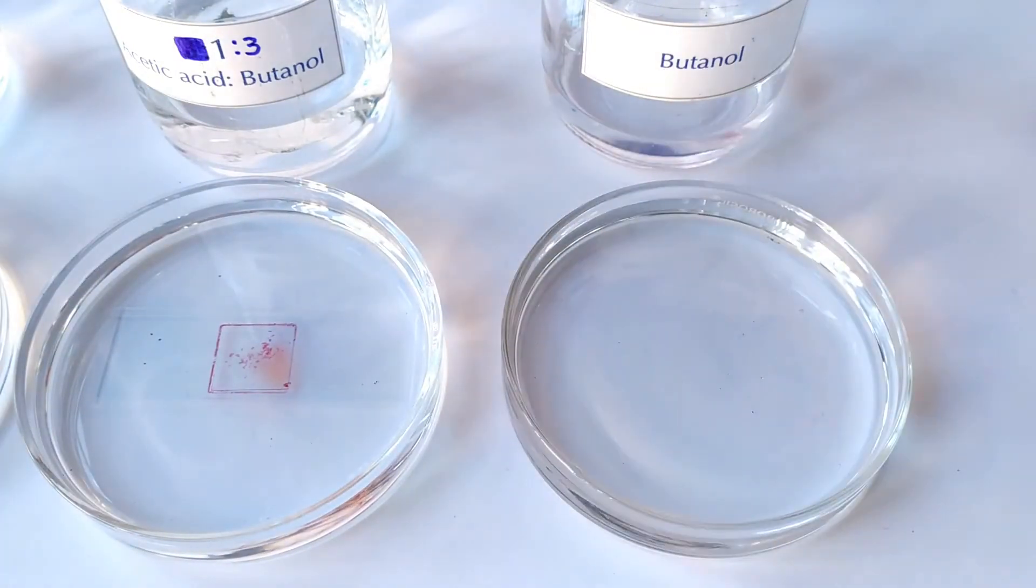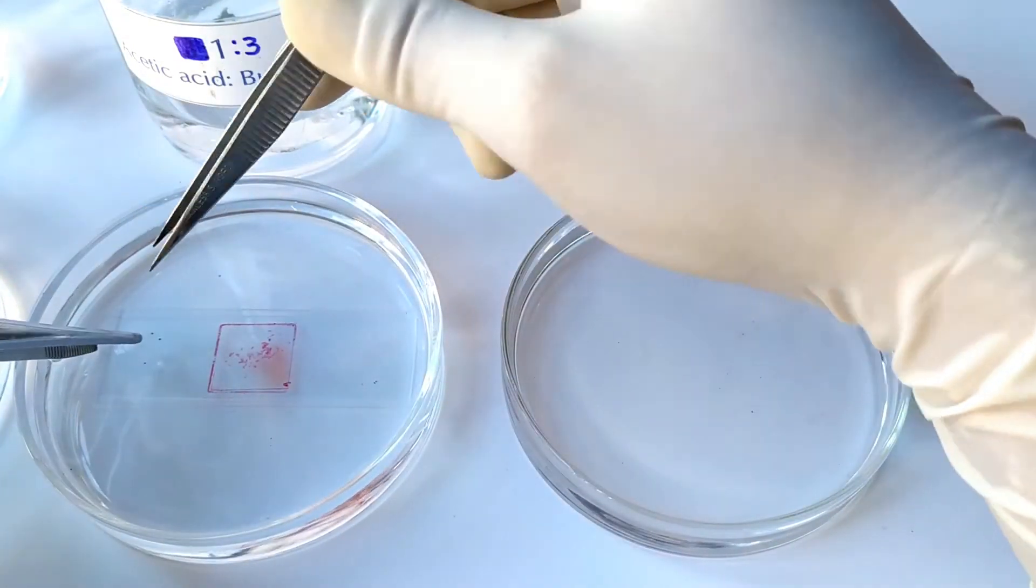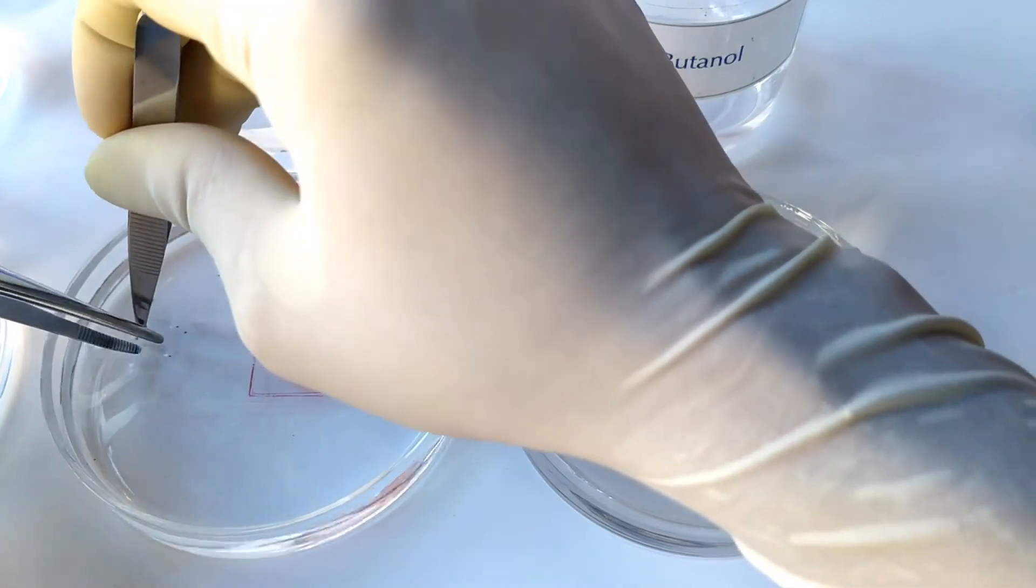Next, transfer the slide and cover slip into a third petri dish containing pure butanol and keep it for another 10 minutes.